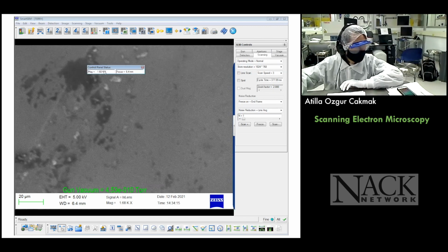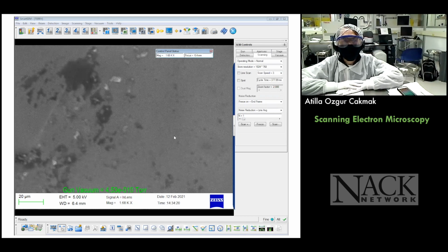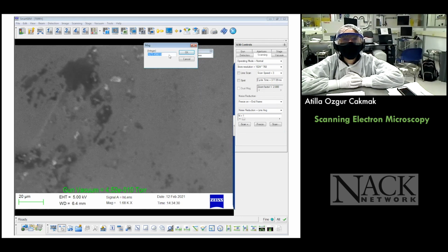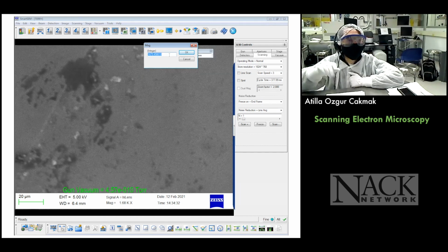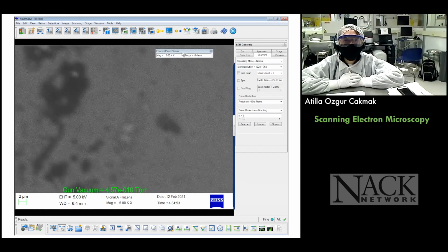Okay, so can you see this little box here where it says Mag and focus? Yes. Okay, so let's go into that magnification box and let's write down the number that we will just put in there. Right, click on it. Yeah. Now it says some arbitrary number because I ended up here using my magnification wheel. So let's put in like 5,000 here. 5,000. Absolutely. And then let's hit OK. All right, I think we might have a little bit of a lag. Great, thank you very much.